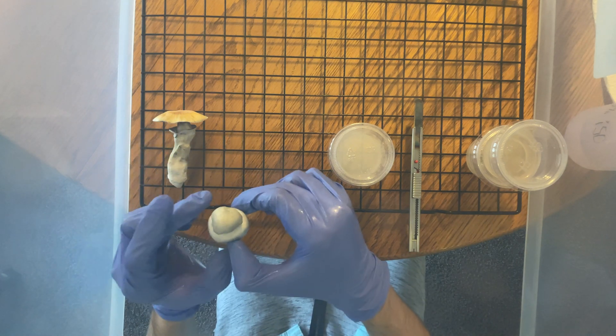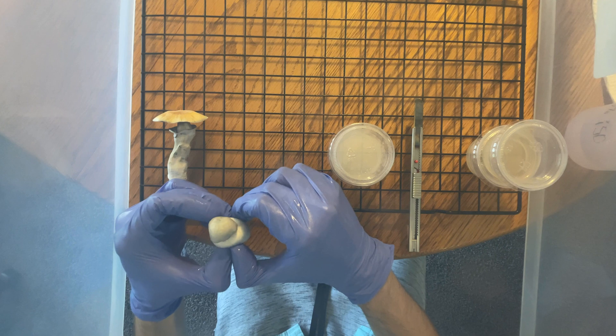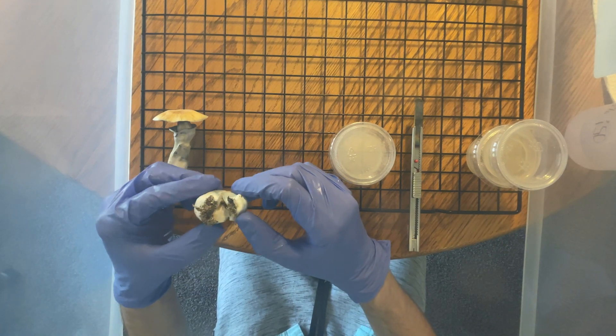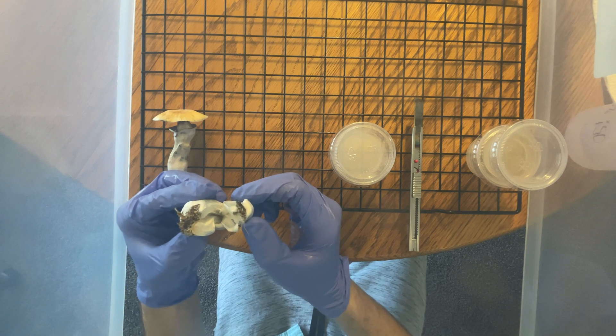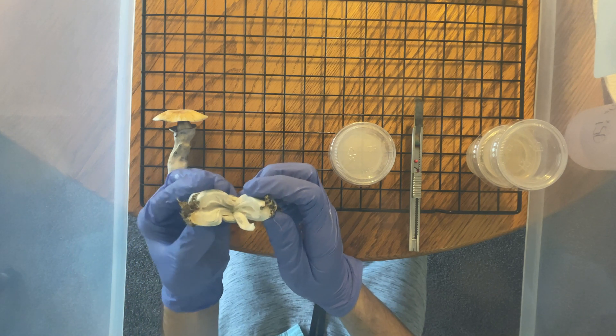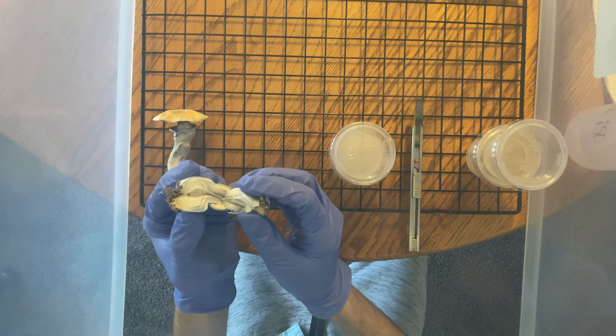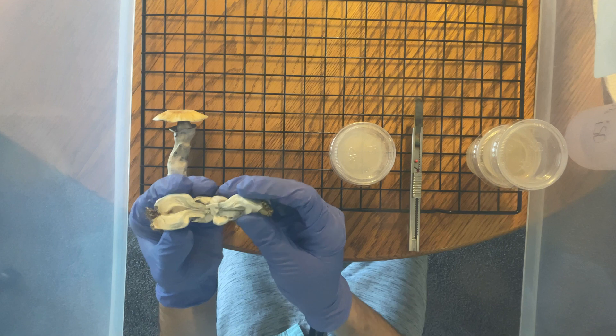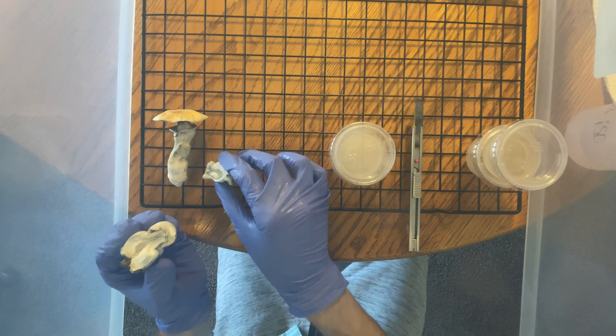Next, pinch the base of the fruiting body until it starts to tear down the middle. This is important, as you don't want to be cloning from the outer layer of the mushroom, as that would cause a lot more contamination as opposed to the inside. It might be a little difficult when you get to the cap, but just slowly work it down the middle and it should end up ripping almost perfectly.